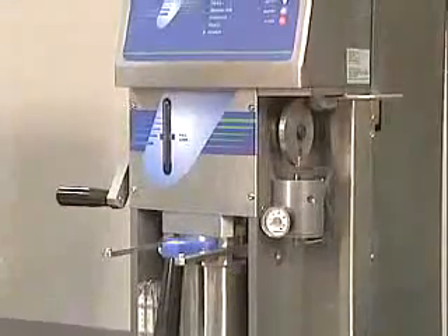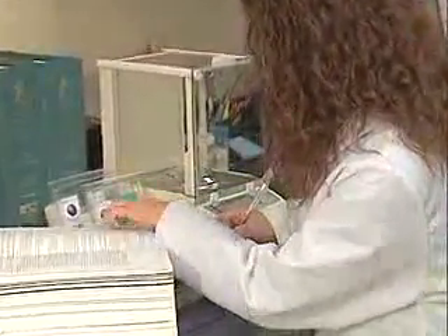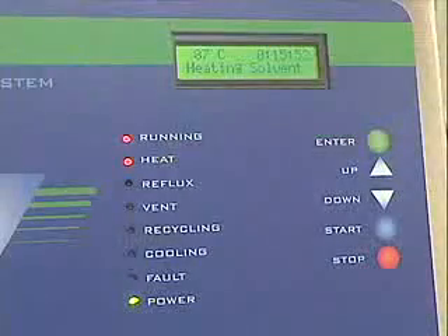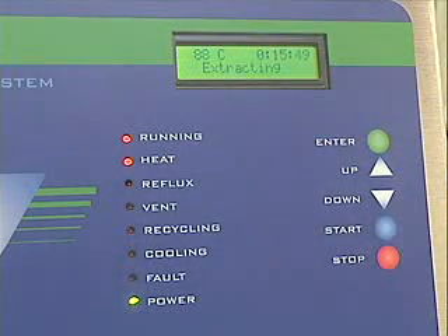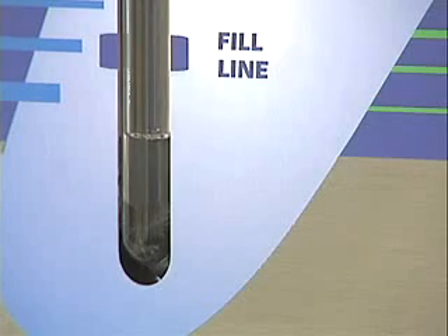Once the process has started, the technician is free to move to other work. No monitoring is required. The system will take care of every step — from adding the solvent, heating the solvent, performing the extraction, and automatic solvent recovery at a rate of 97% or better.